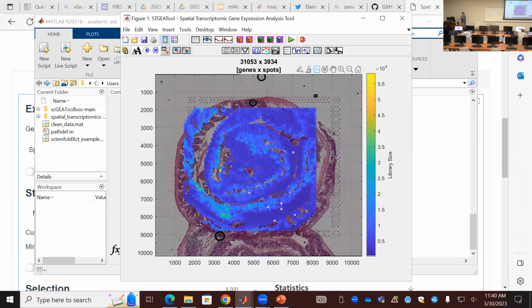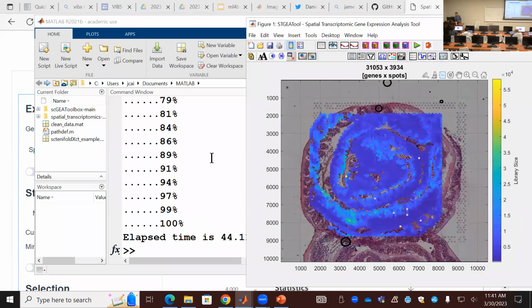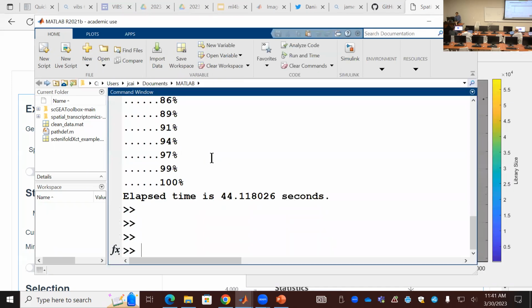Okay, look, this is more complicated. You have to be very skillful to align this. If you have this, give it a try. Again, the ID is, this is ID.